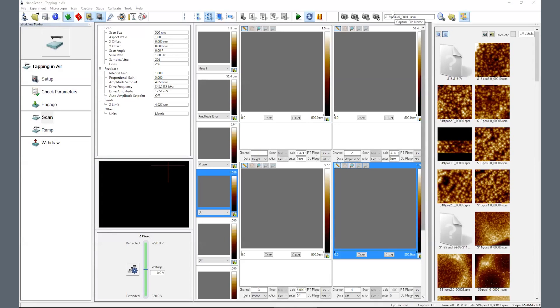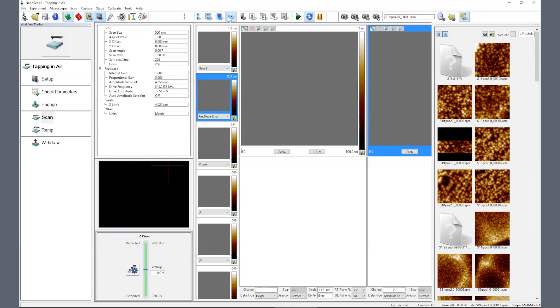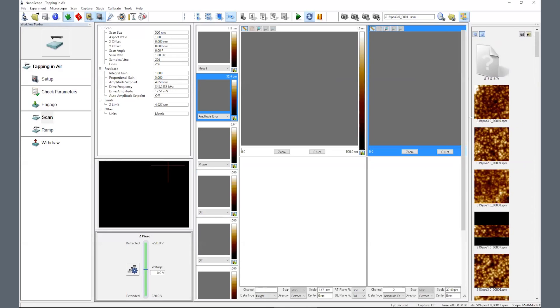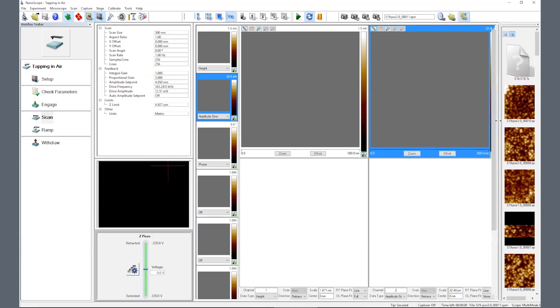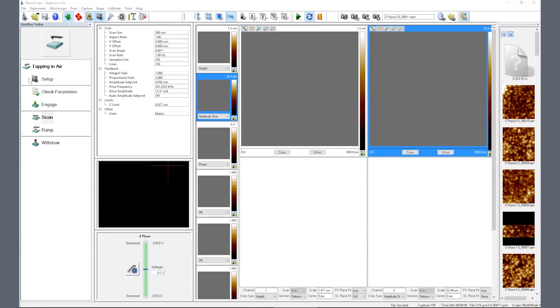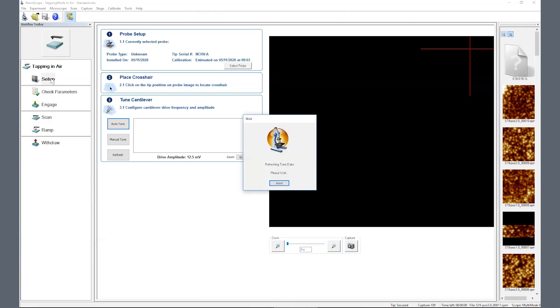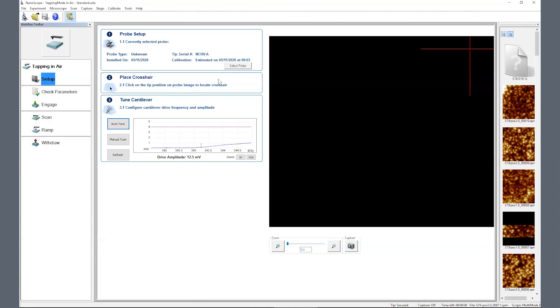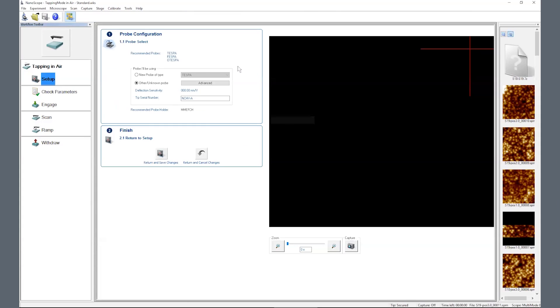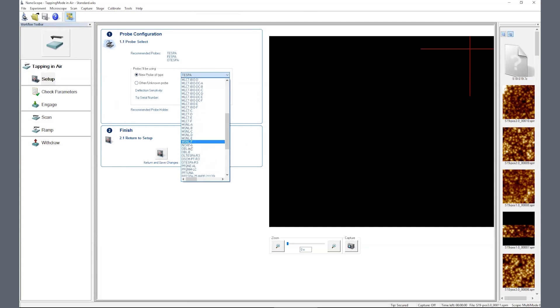The starting parameters and available channels are opened and displayed. Set up your windows as desired. Then select setup from the workflow toolbar at the left of the parameter list. You are now ready to load your sample and probe.